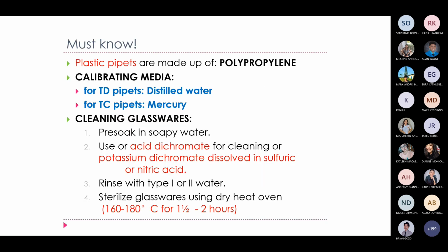Okay, must know, nabanggit na natin, the plastic pipettes are made up of polypropylene. For the calibrating media, for the pipettes na may TD na sign or to deliver, distilled water. And for to contain pipettes, ang ginagamit na calibrating media is mercury.